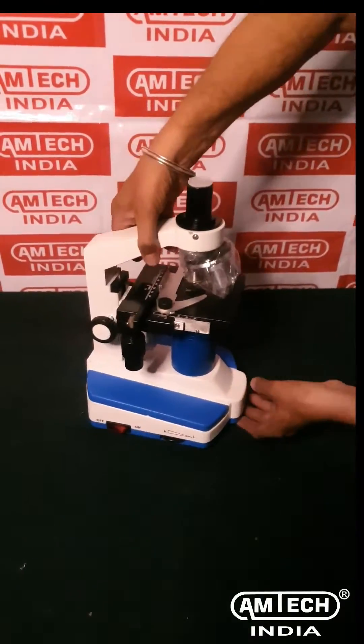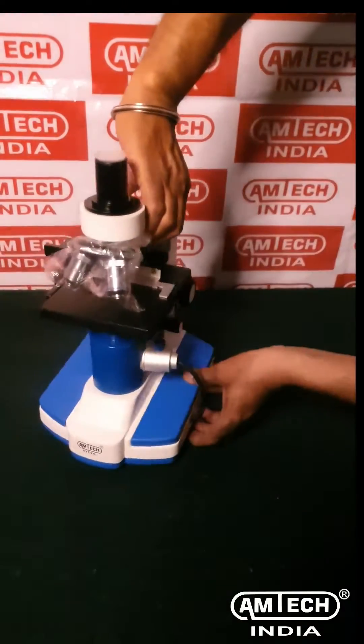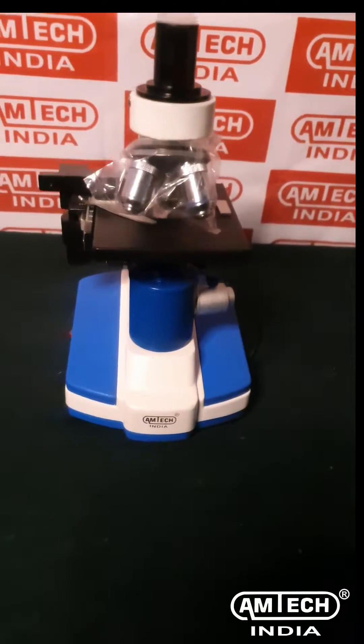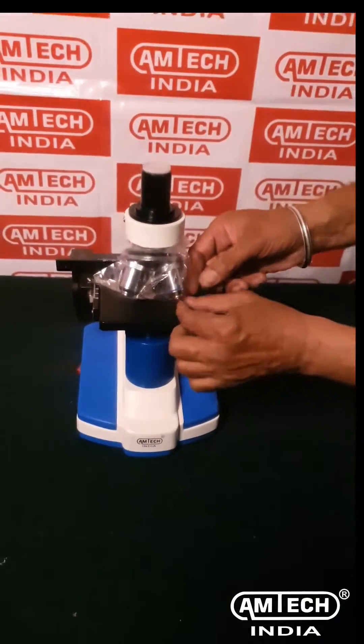Projection microscopes are used in classroom studies for group discussions. This video illustrates the demo and working of a projection microscope.